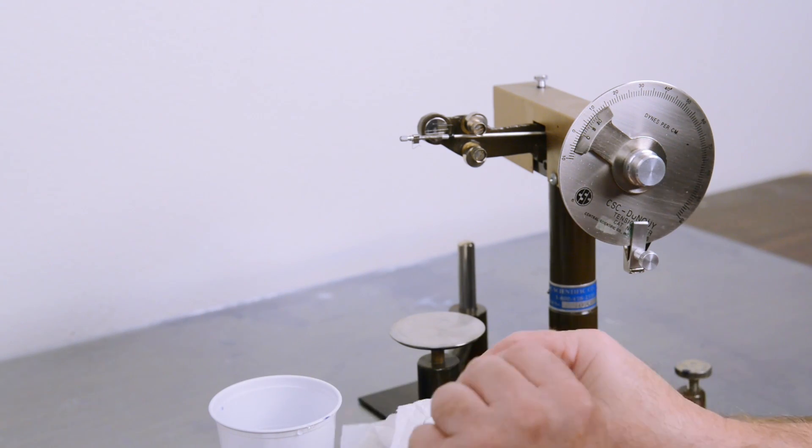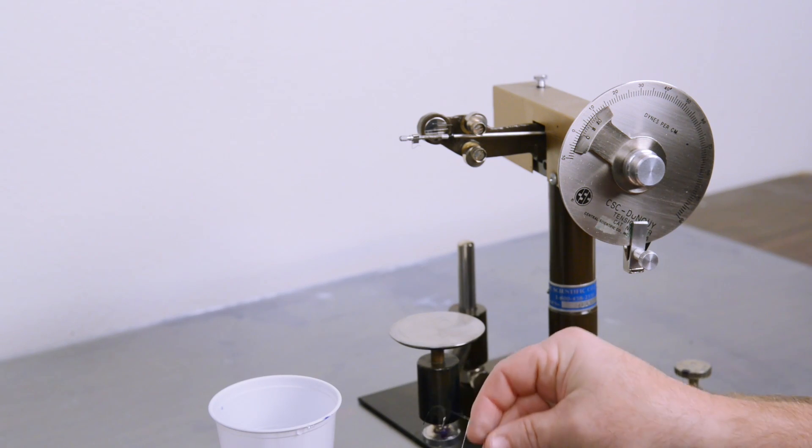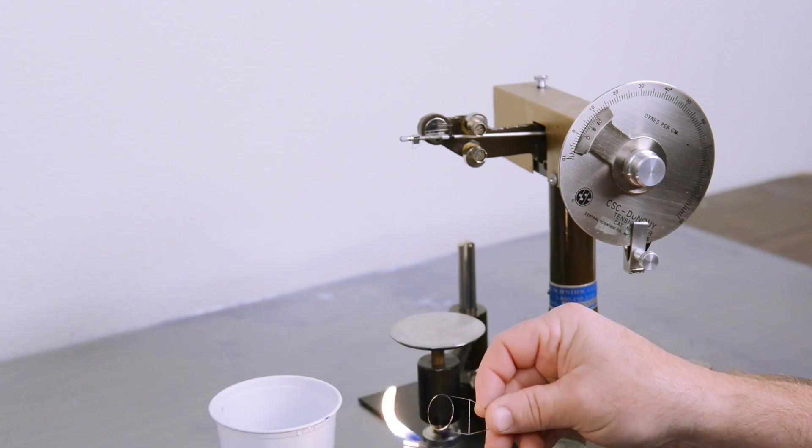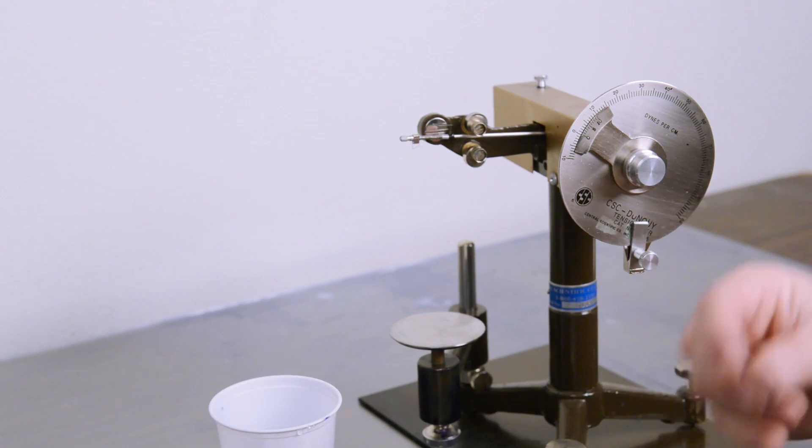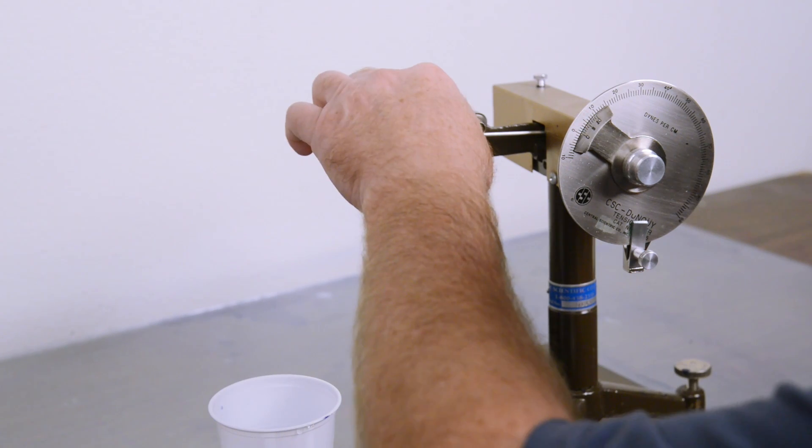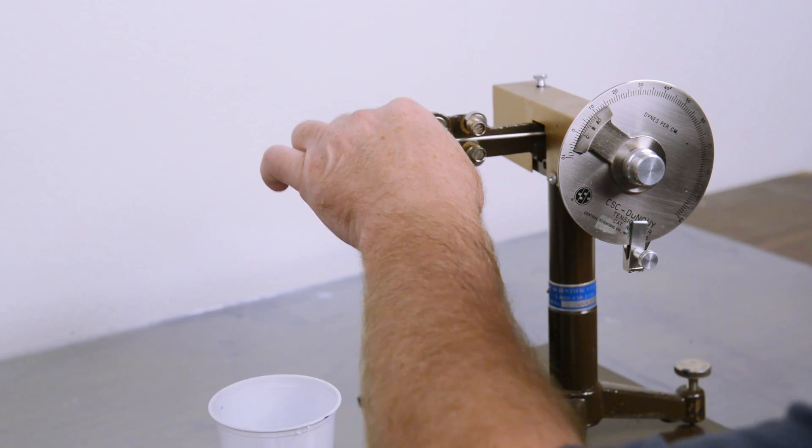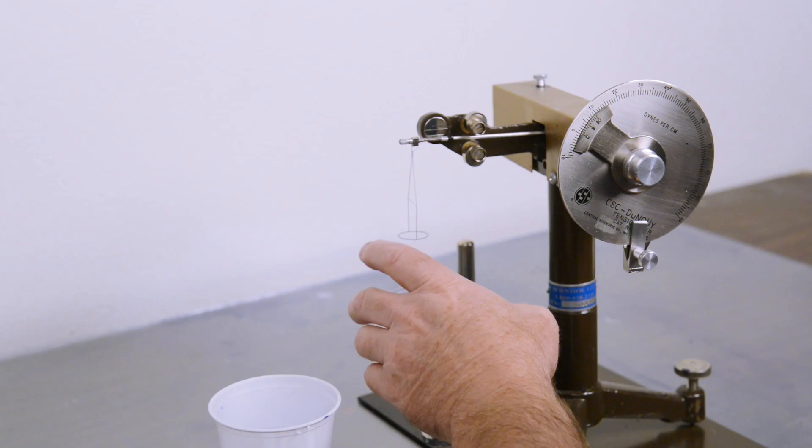We will dry it off a little bit, flame it so there is no contamination from one thing to another. Put it back on the arm. New petri dish.